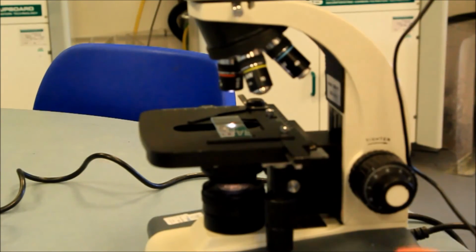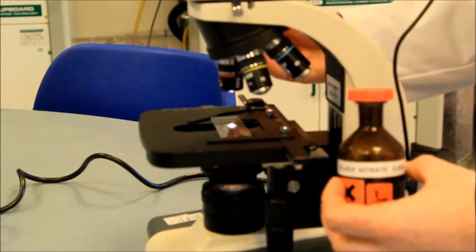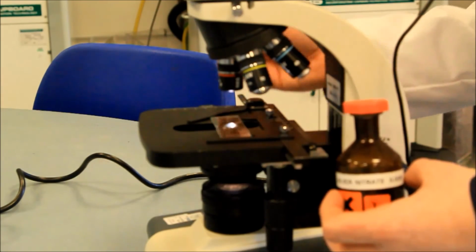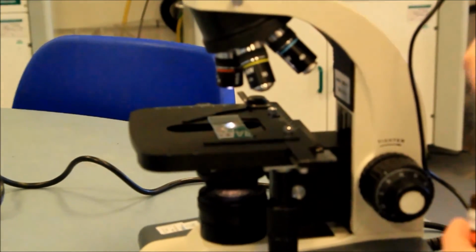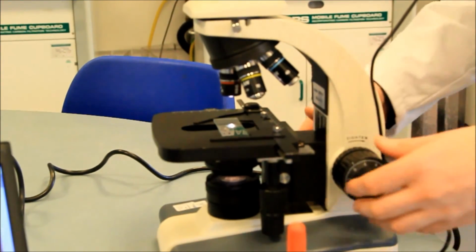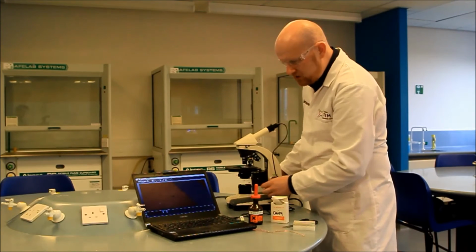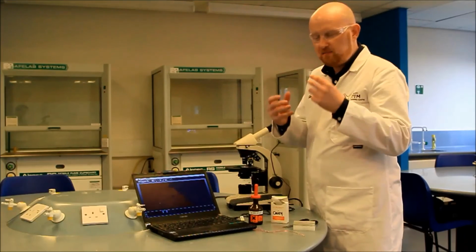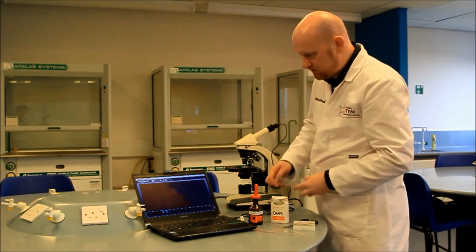And to that, I'm going to add just a couple of drops of silver nitrate. Like so. And we should see very quickly, and we can there, our silver crystals growing. And as these grow, they look a bit like trees in a winter wonderland in our landscape. Sometimes they can look very silvery, again emulating that silver landscape. I'll take my goggles off now.